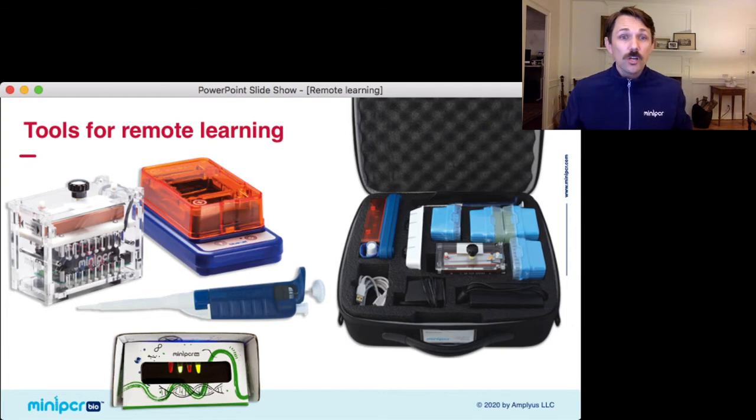And so we started working with these teachers directly, some from college, some from high schools, on an individual basis. And in these early efforts, we had a lot of success with students doing whole labs, labs that would typically be done in the classroom at home, using equipment that's being mailed to them or delivered by their teacher, using it and then sending it back. One of the reasons that this was successful for us is that we have a fair amount of experience sending our equipment to naive users and working with them remotely to get it working.